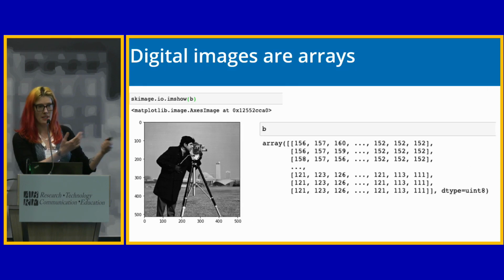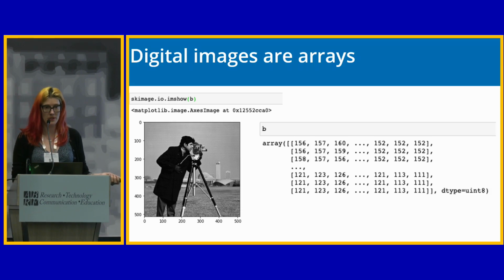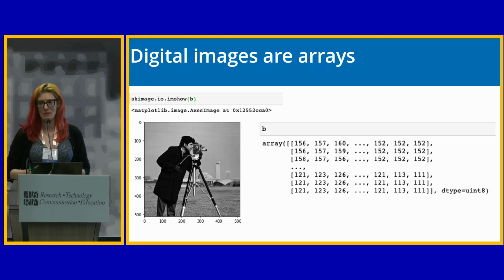You can easily expand upon that thought and say, okay, if we have a much more complex image, we have a more complex array of numbers, right? I have a much bigger X and Y, much bigger intensity range. You can have layers upon layers of information, all your different channels. But at their core, we're just looking at arrays of numbers, and with arrays of numbers, you can do math. And math is quantitative. Hopefully I don't have to convince you of that one.